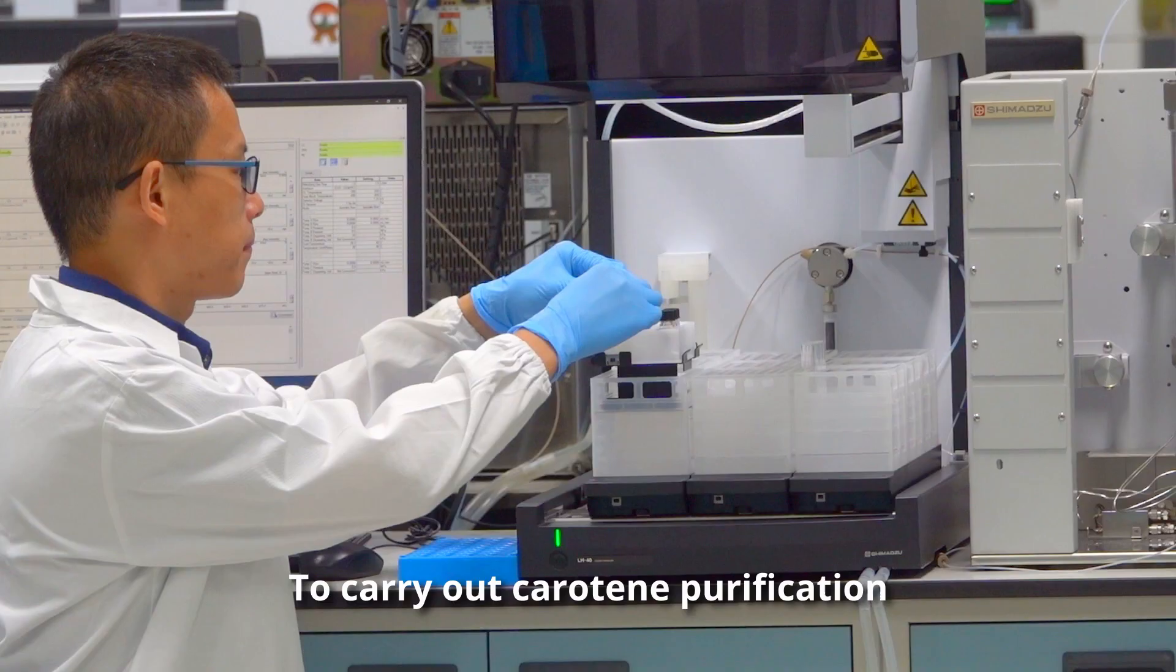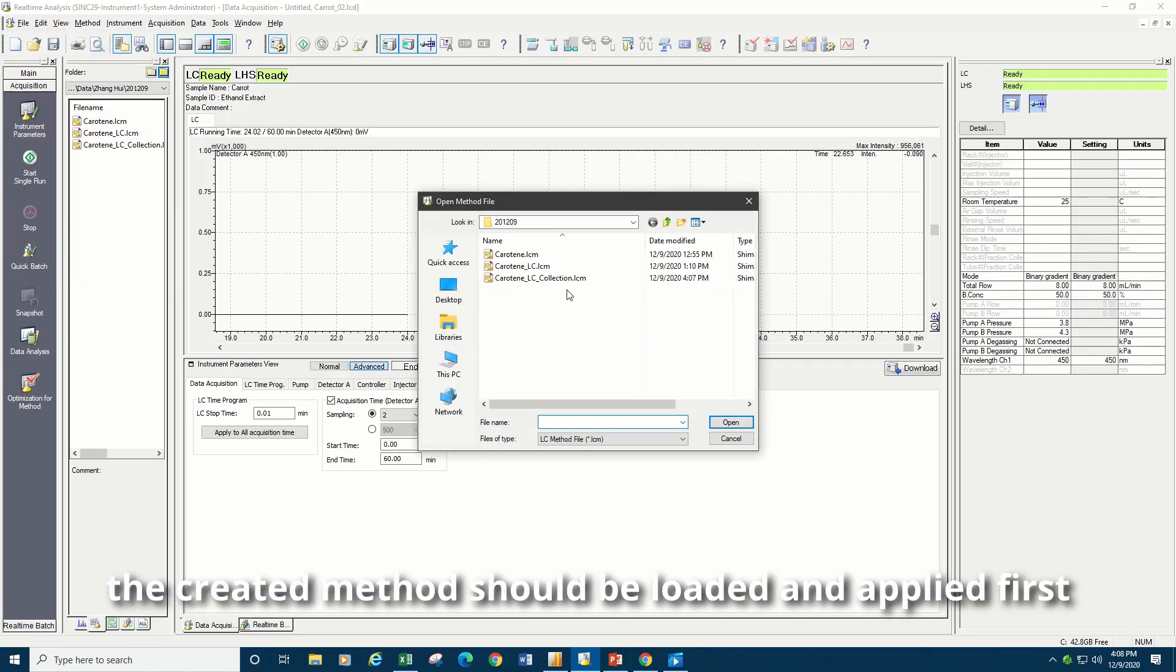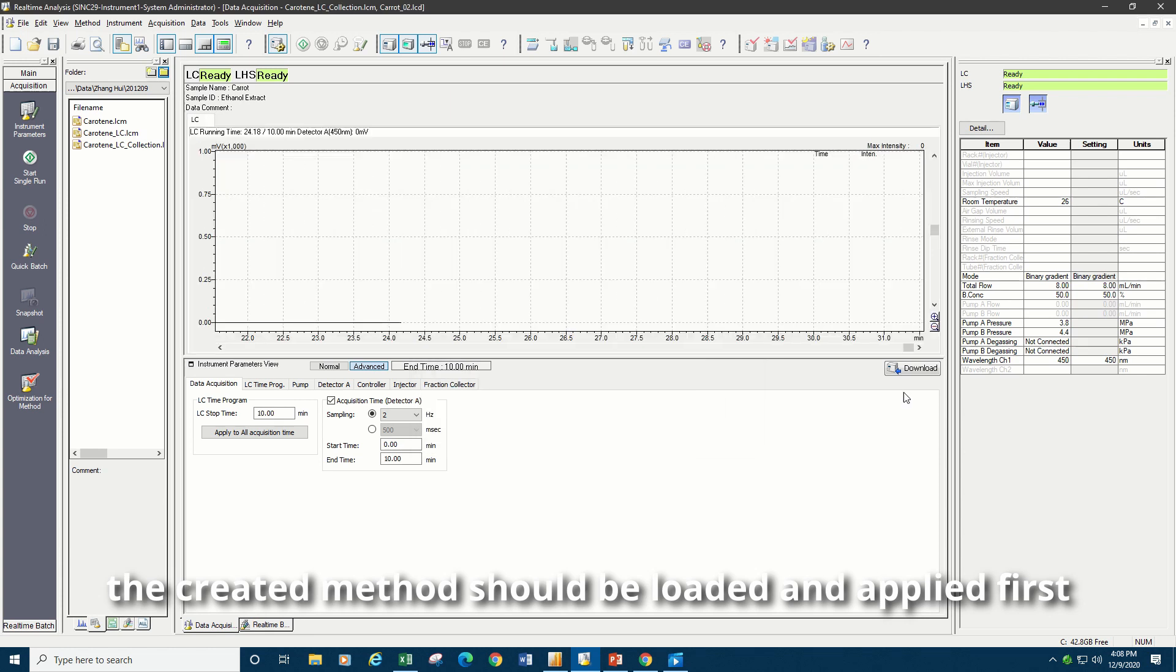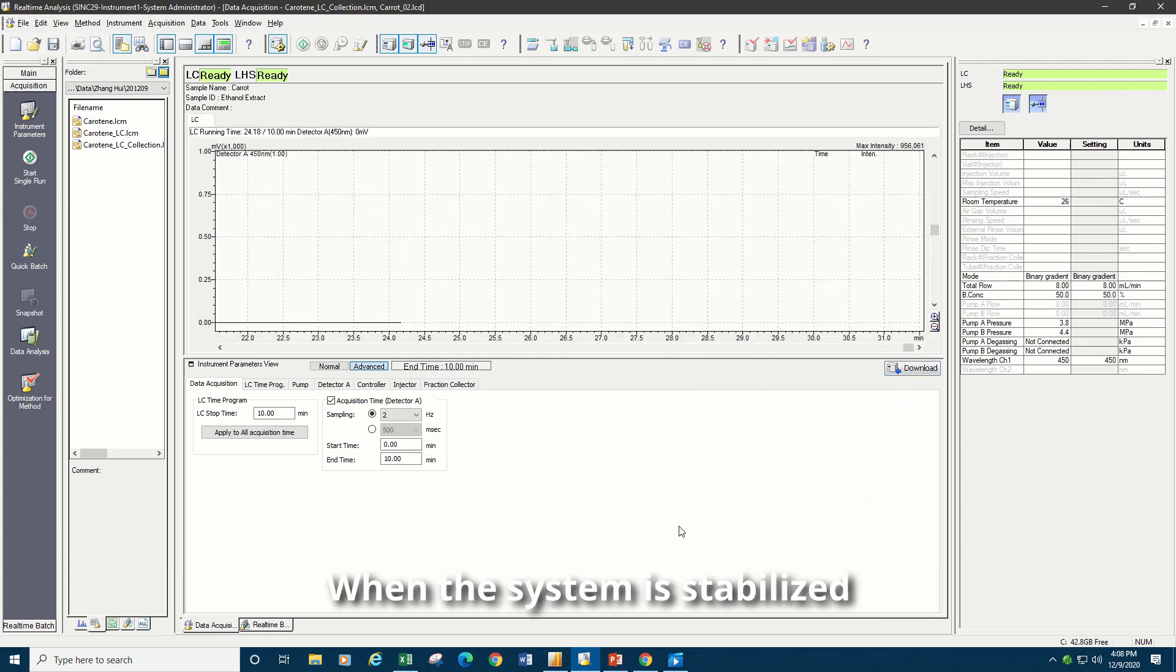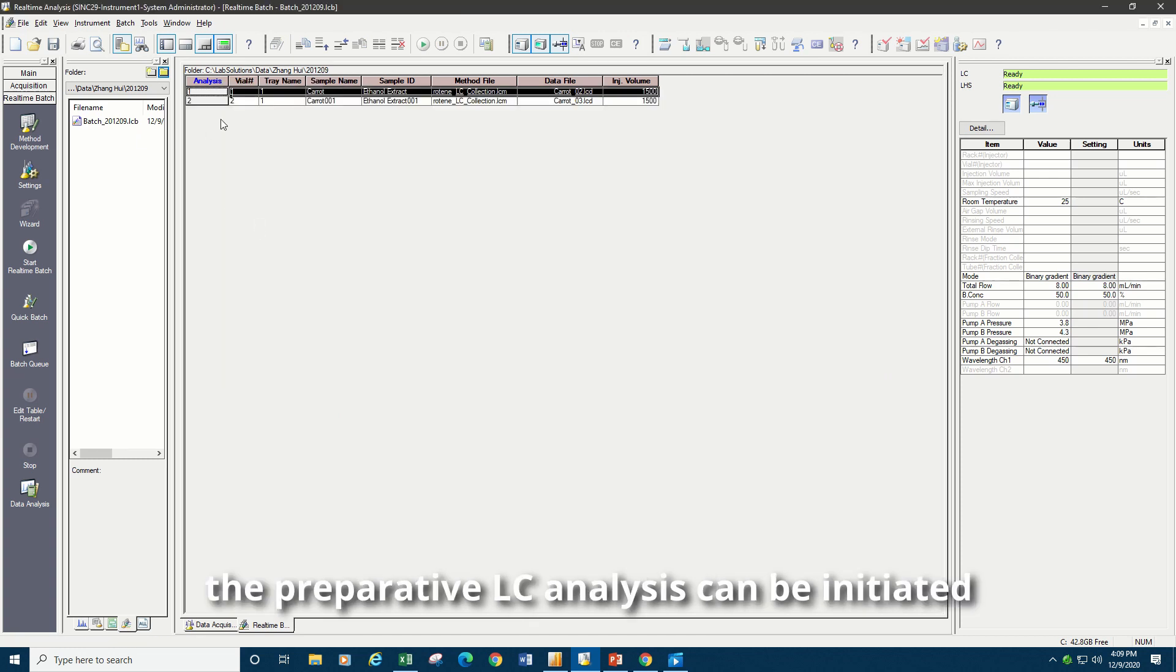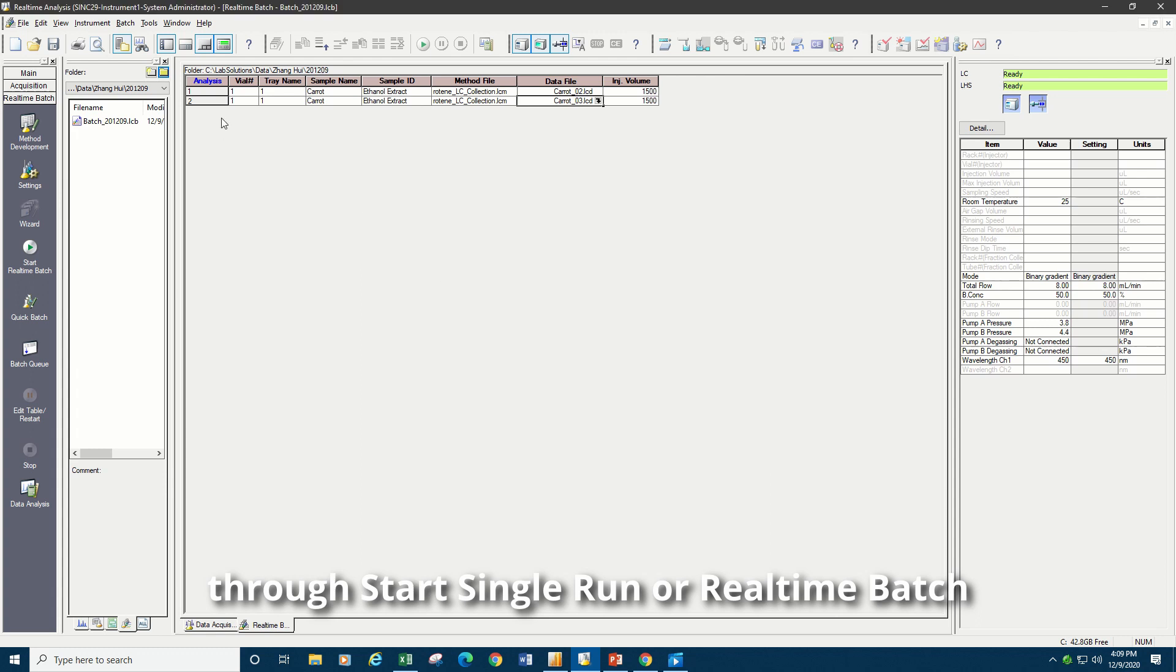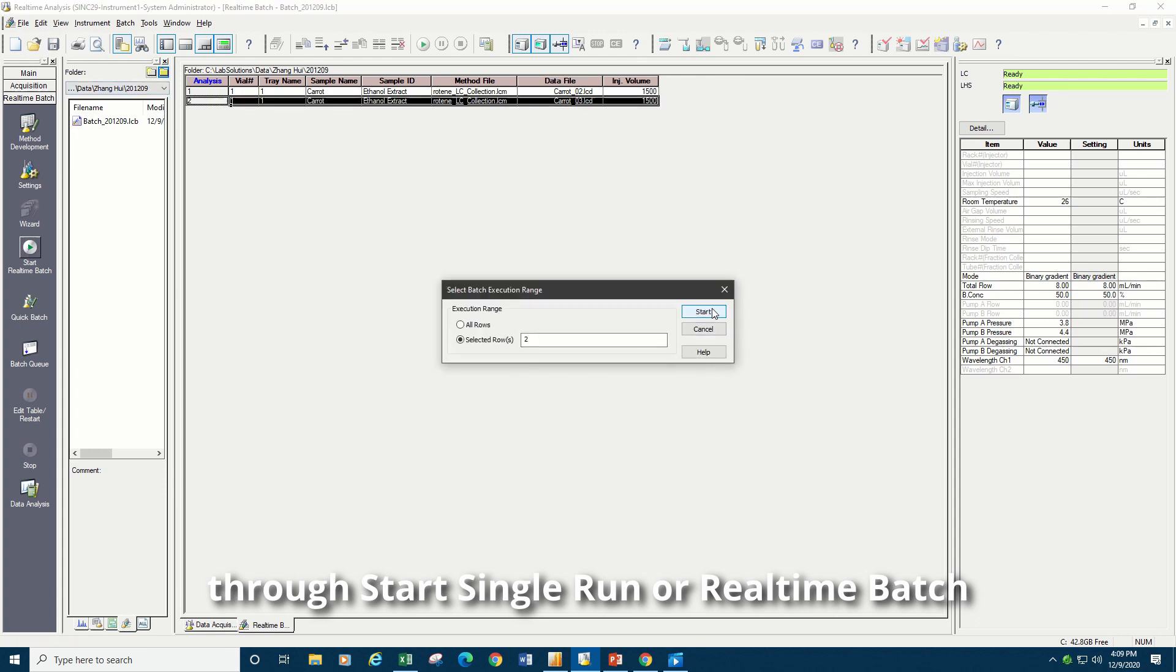To carry out carotene purification, the created method should be loaded and applied first. When the system is stabilized, the Preparative LC Analysis can be initiated through Start Single Run or Real-Time Batch.